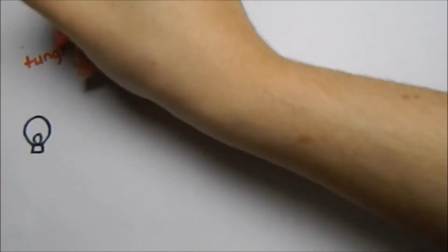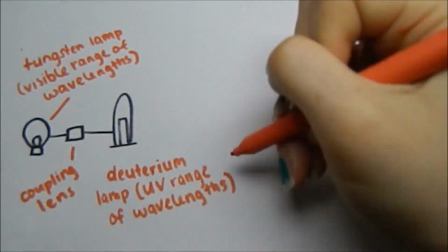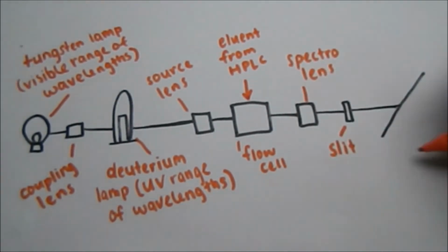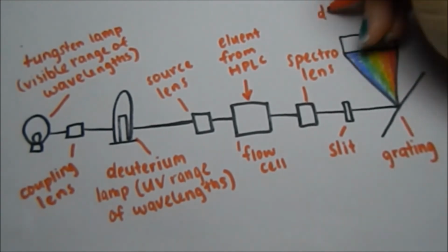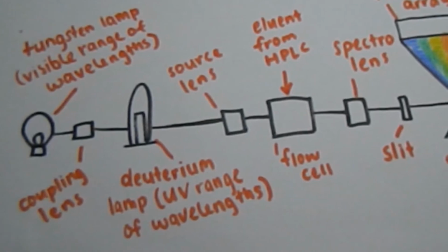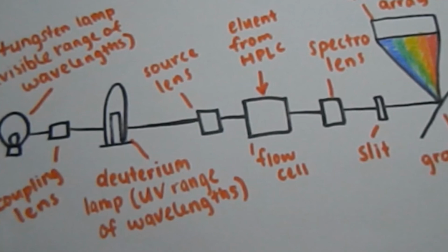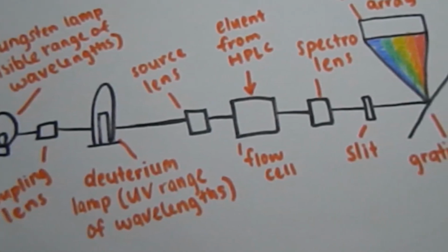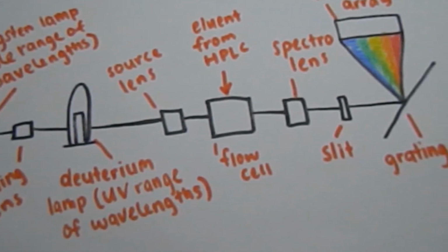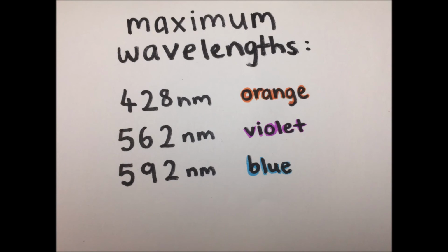The analytes were detected using a UV-Vis diode array detector, coupled with the HPLC. The combination of tungsten and deuterium lamps gives off a broad emission spectrum of wavelengths between 200 and 800 nanometers. Thus a wider spectrum of analysis. As the solute is eluted, the light through the flow cell is dispersed by diffraction grating into the diode array. The use of a multi-wavelength detector is advantageous, as the analyte is conducted at multiple wavelengths simultaneously. Therefore, the absorption of the analytes is easily obtained.